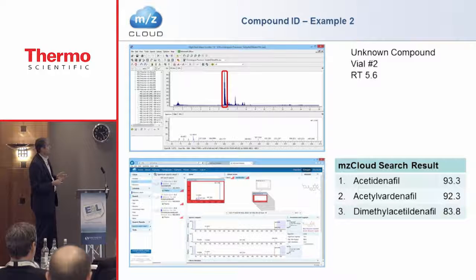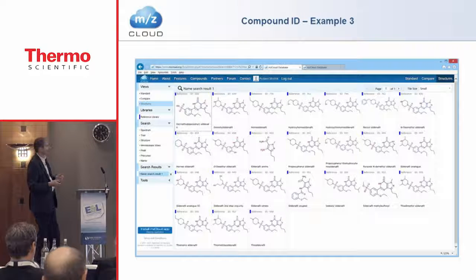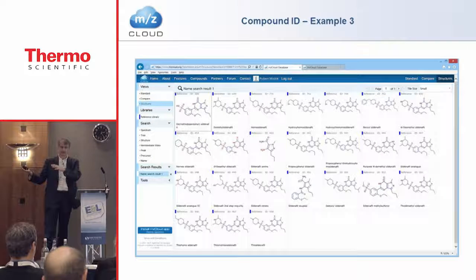Another example, so we have searched those sildenafils, and we got exactly the same result using exactly the same method. This is our hit list. And with other techniques, you can also do the substructure search. So you can do it in reverse order: you search based on a substructure to see what kind of spectra it would exhibit in my sample.